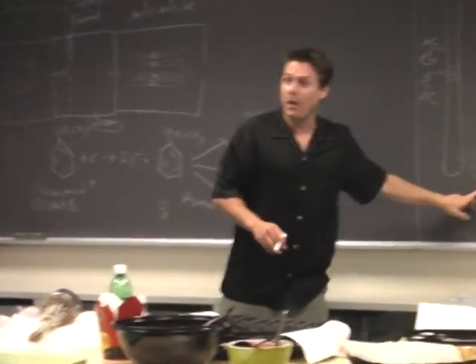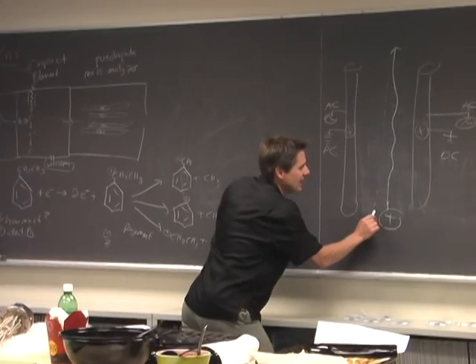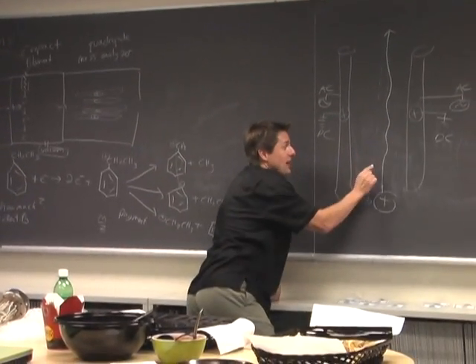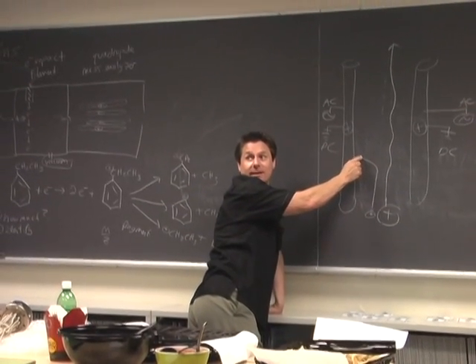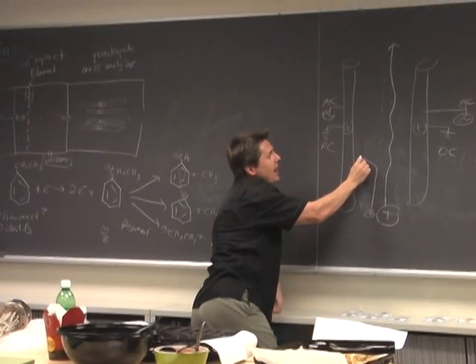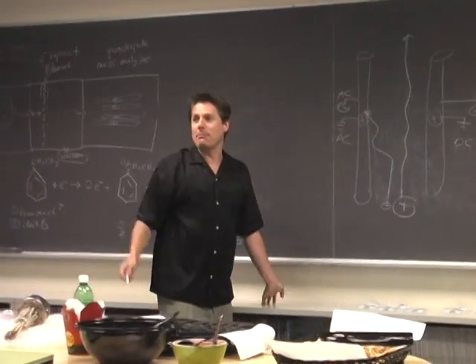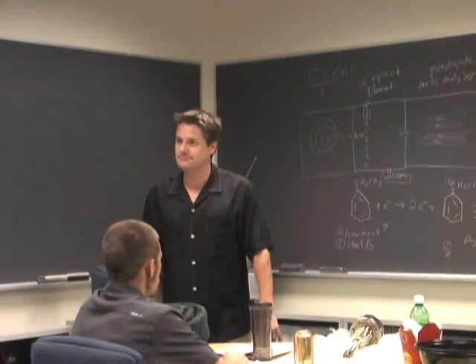Well, let's look at the small one. We're now with a speedboat. We can turn on a dime. Originally, it's repelled by both. But now what happens when these turn negative? Boom! It can turn real fast. And it's straight shooting right down. It goes, it's negative. Now it's positive. Now it's negative. Crash and burn, baby. It's gone. It hits the rod, neutralizes it, gets sucked out.